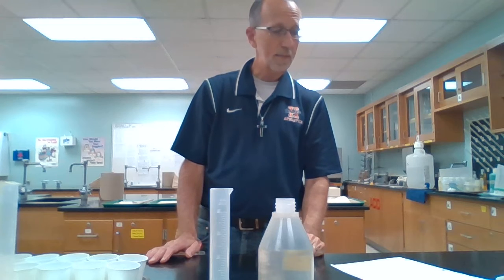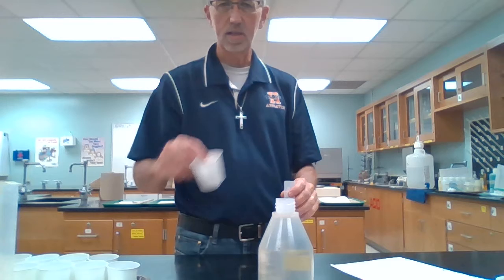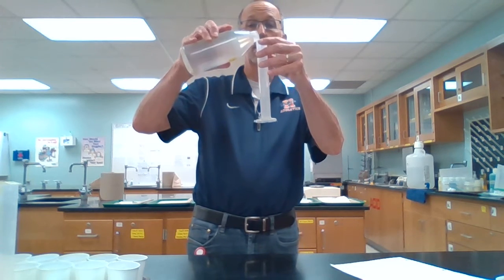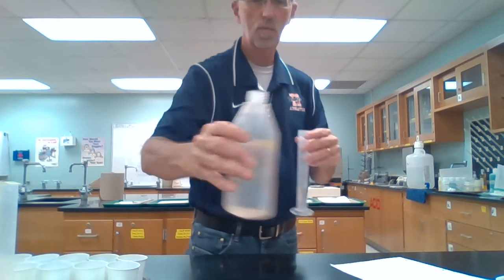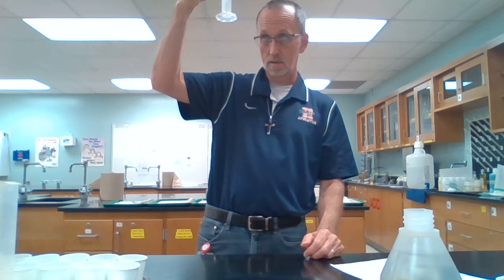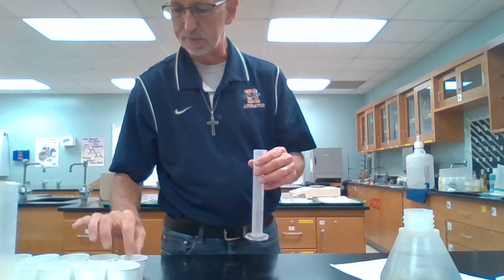So we'll go back to copper now. So volume 1. Now with these little pieces, we're going to have to do water displacement. Make sure I get an ample amount of water in there. All right. So looks like we got right on the line, about 15.0 mLs.